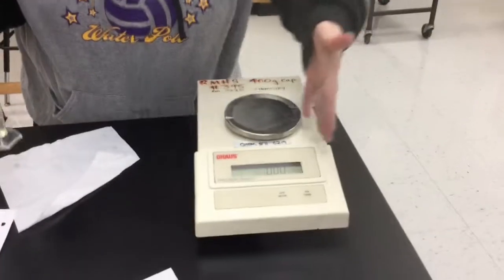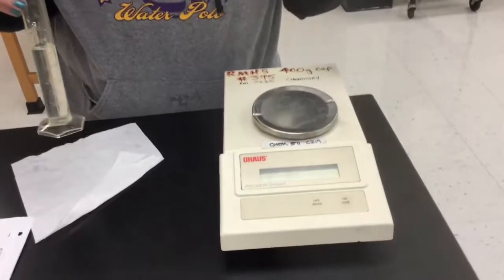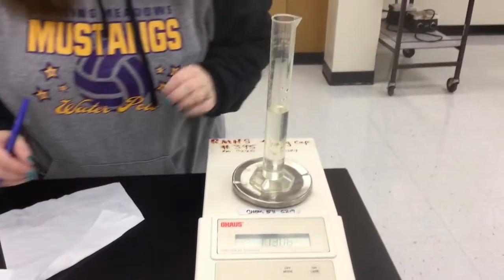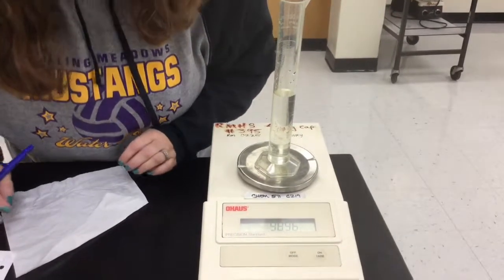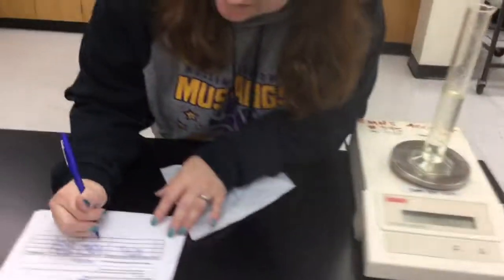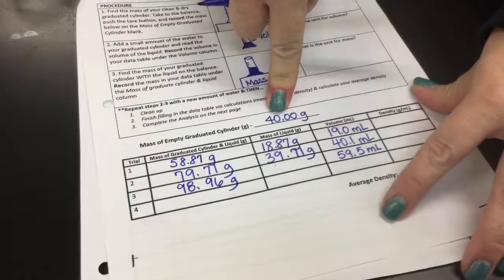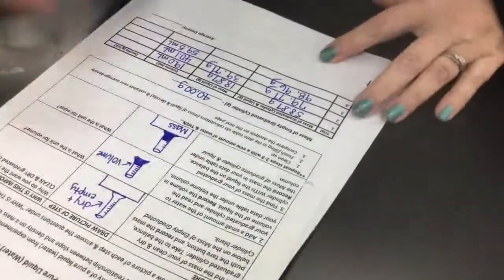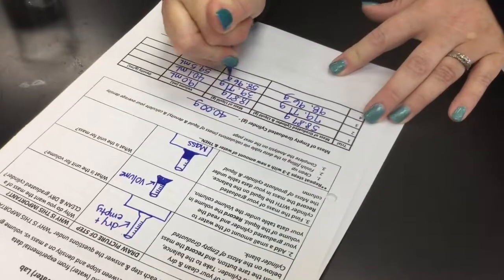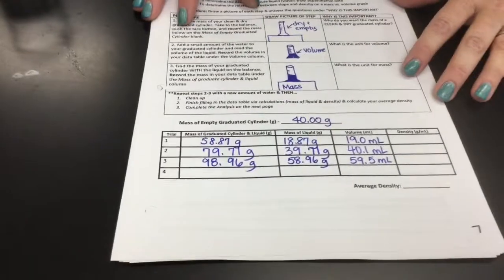Now mass. Tare. I'll just tare it just in case. You never know. Always want to tare. Even if you see 0, just push the tare. Ooh. 98.96. Let's go. Right, 96, because it seems to stay on the 98.96 grams. Okay, so 98.96 grams minus 40 is 58.96. We got lucky with a 40.00 graduated cylinder mass, so we can do this in our heads. Yes. Which is helpful.